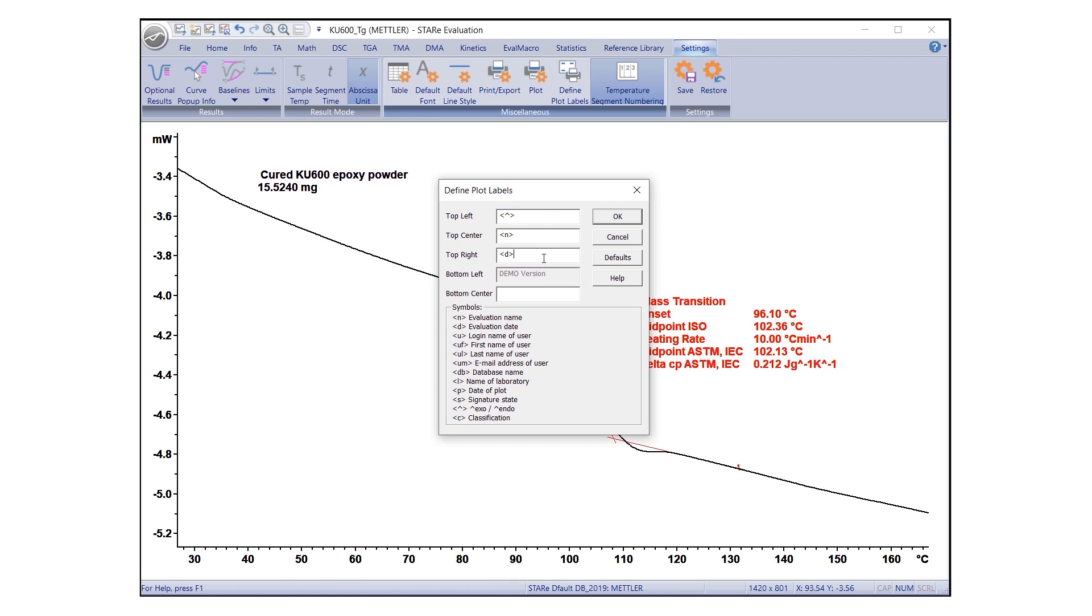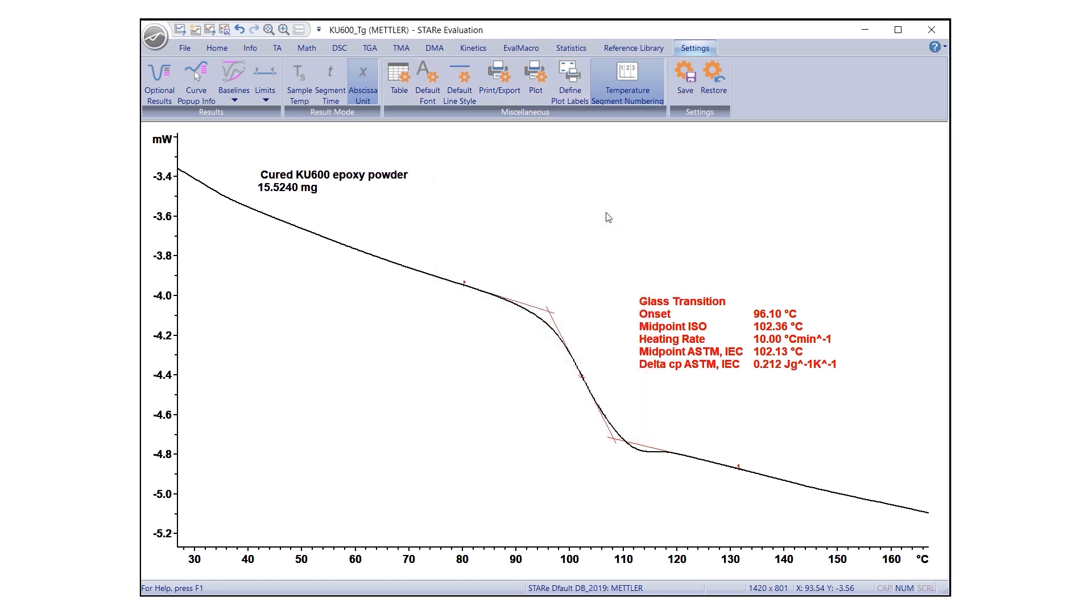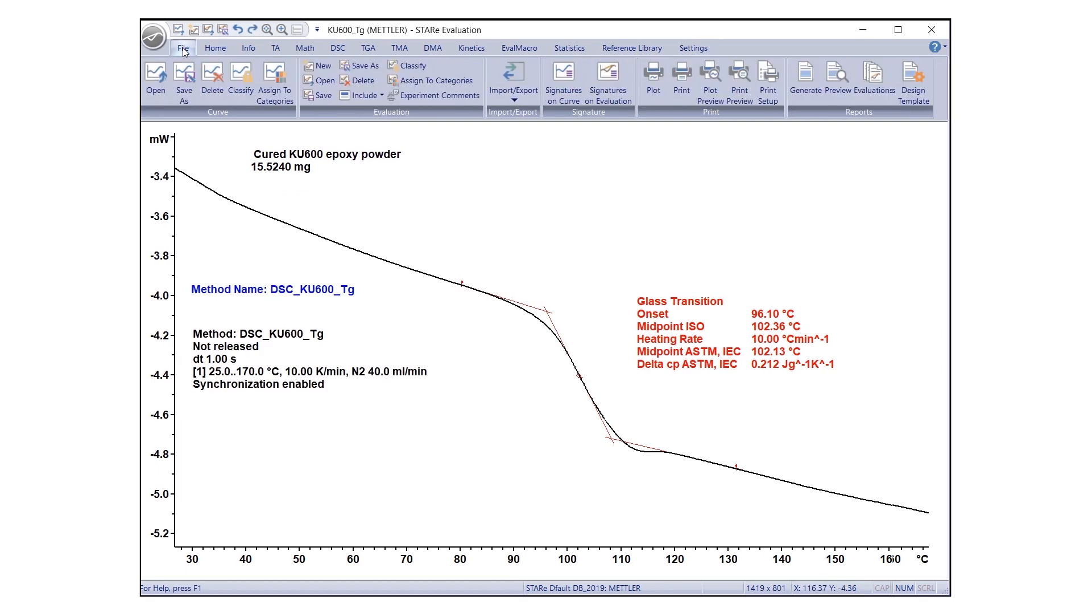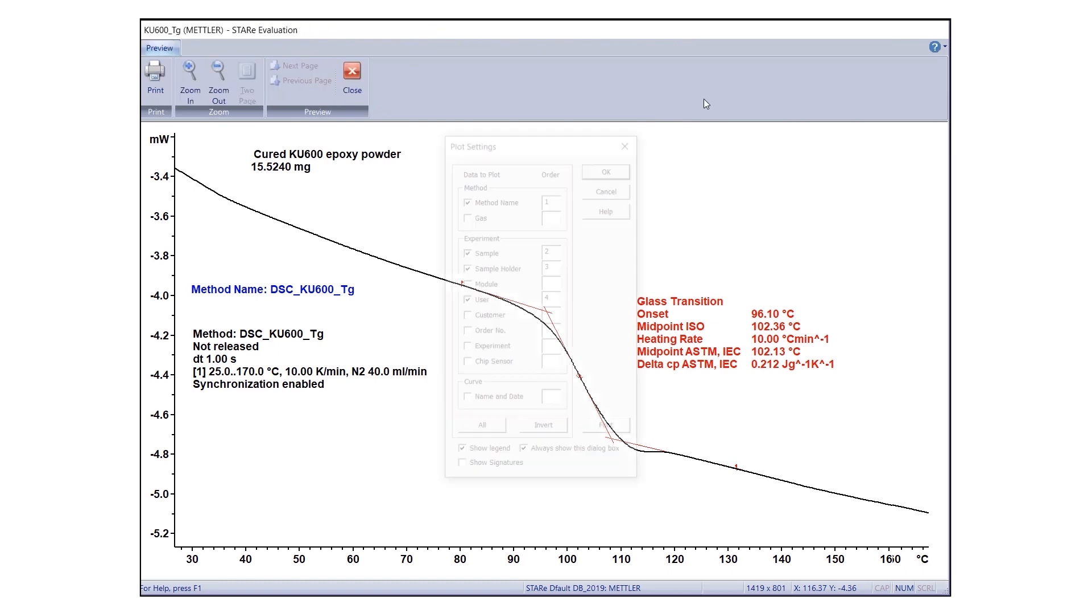Add the labels you would like to include by inserting their corresponding symbols into the desired text field. For example, top left or top right. Multiple symbols can be included in the same text field. Then, click OK. The appearance of your final evaluation can be viewed by selecting Plot Preview under the File tab.